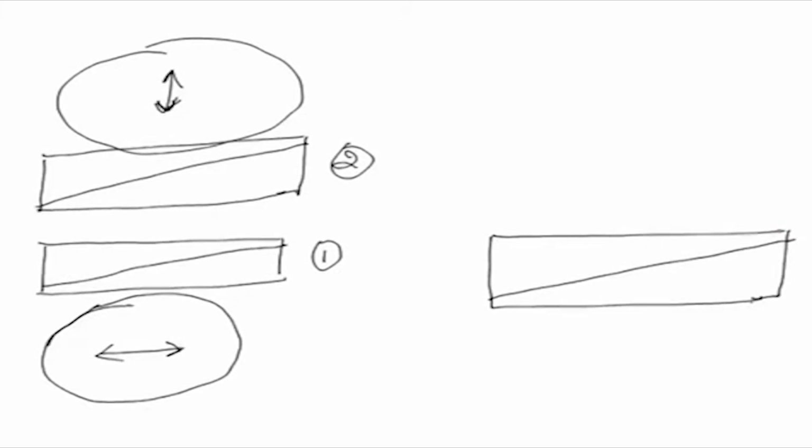Now this plane polarized light enters the modified Wollaston or DIC prism number 1. When it enters prism number 1, it gets split into two separate rays. One is called the ordinary ray, denoted by O, and the other is called the extraordinary ray, denoted by E. These two rays are spatially separated, or in this term, sheared.